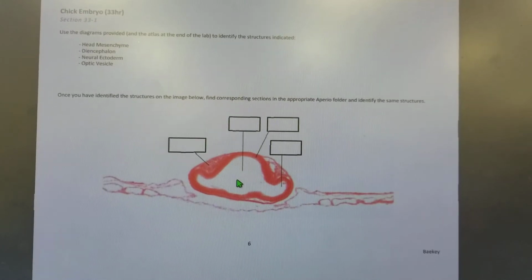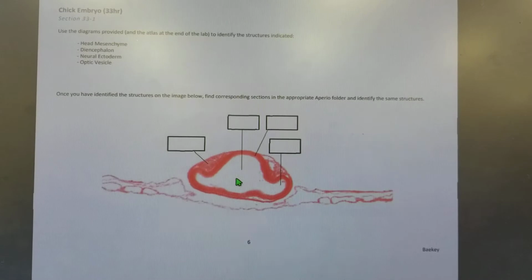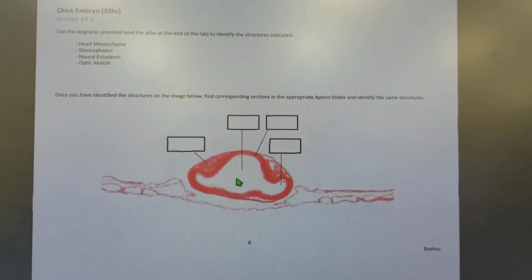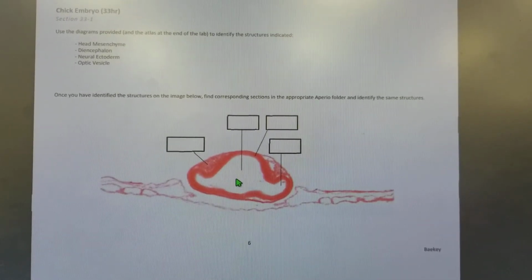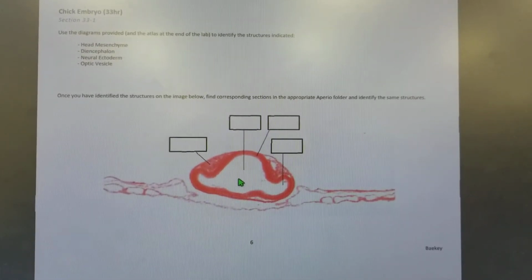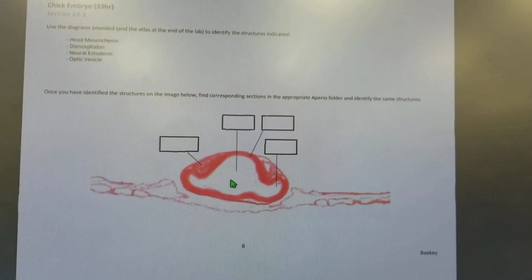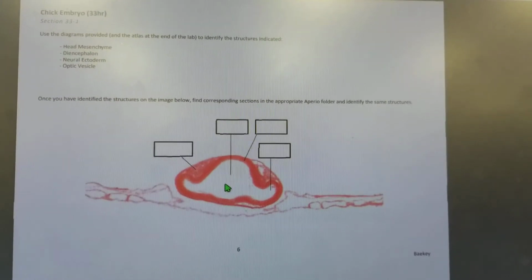Then those three parts break up and get subdivided into five parts, for which we typically have representative sections grossly in the host, in the fetus and beyond. Those are the telencephalon, the diencephalon, the mesencephalon, the metencephalon, and the myelencephalon. And that goes cranial to caudal.